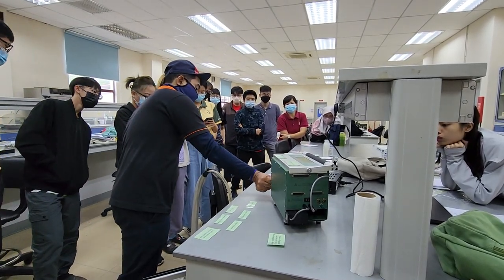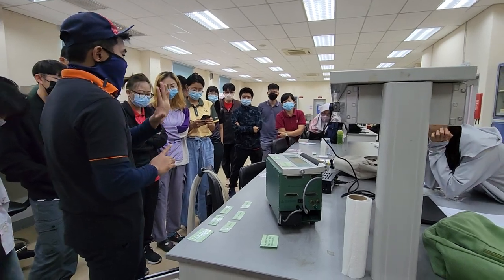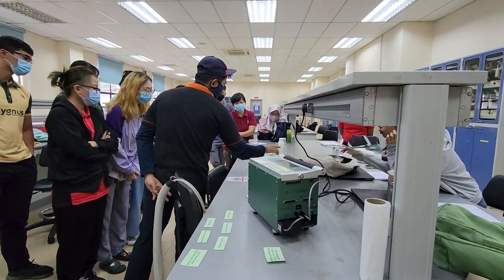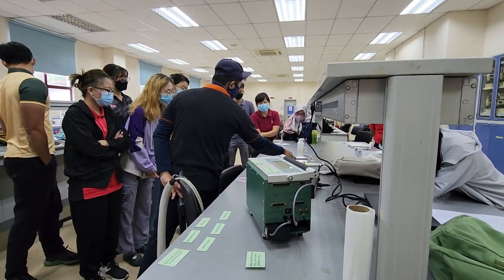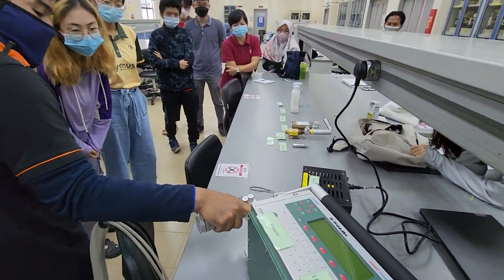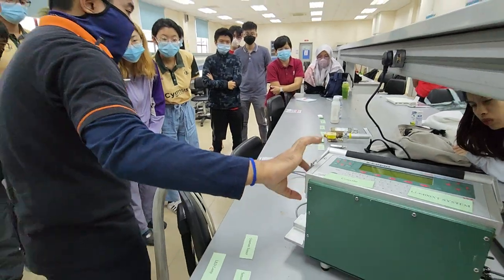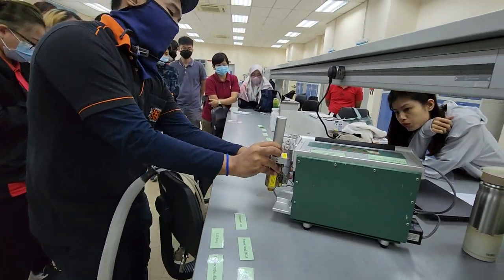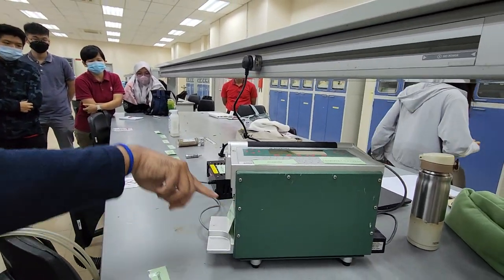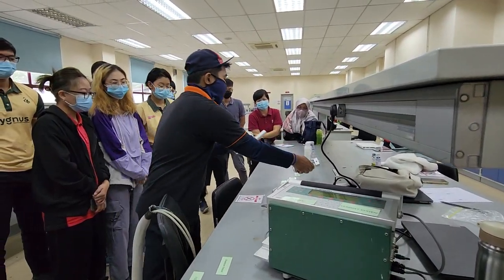Then you have one side here, which is called the chemical columns side. This side is equipped with three chemical columns. What are the chemical columns? We got the desiccant column that goes in here. You see, it says here, desiccant column. Then we got the CO2 column right in the middle, and finally we have the CO2 scrub column, which is this one that goes right over there.